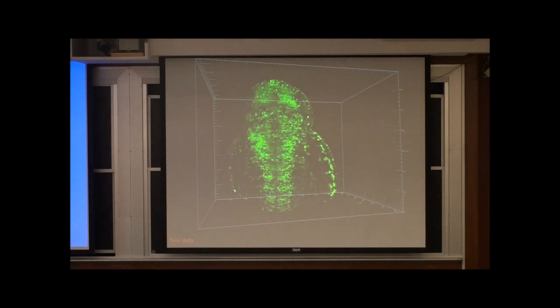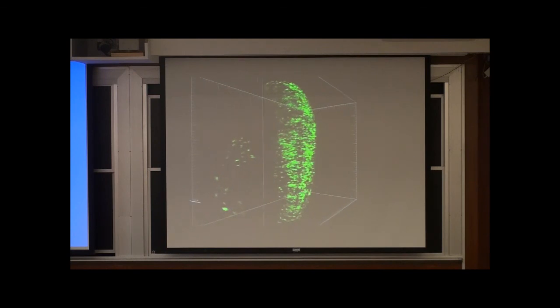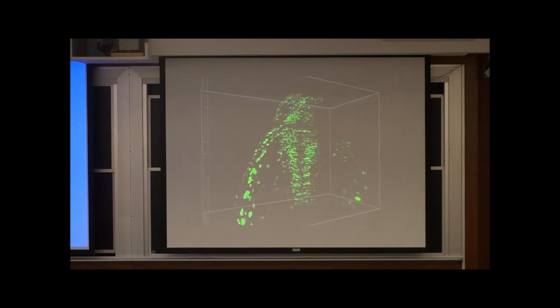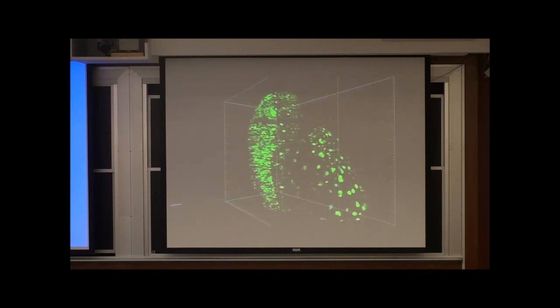So this is one of the images of the fish. This is the eye socket. This is the spine. This is the raw data. Once you do the three-phase processing, you can get rid of background, but at higher depth it doesn't work so well. But high-low works even better. So from this image you can get a much better image with background reduction. And ultimately you can see the structure in 3D, with much background reduction. These are really high depths, around 500-600 micron. These are histone EGFP tagged, so you can see individual cells.